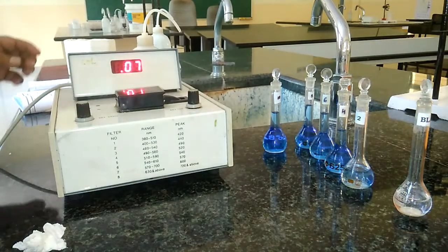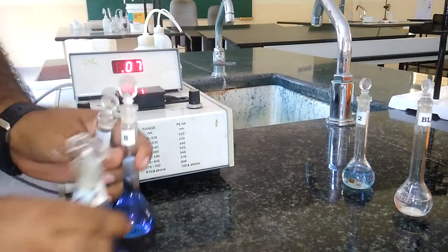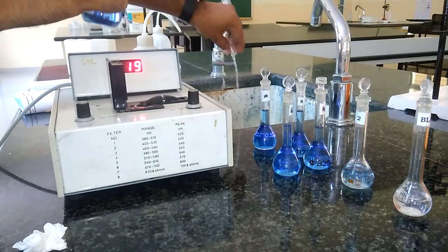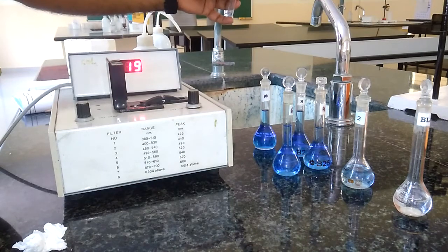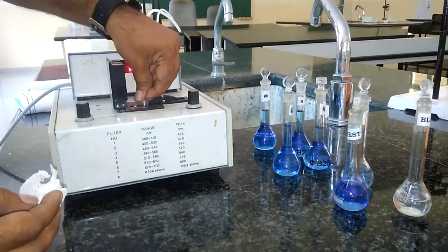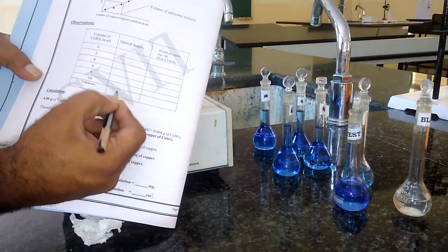Similarly, we record the absorbance of all the standard solutions — 4 ml, 6 ml, 8 ml, and 10 ml. After recording all standard solution absorbances, we also record the absorbance of the test solution. Rinsing the cuvette with the test sample, then filling three-fourths and wiping well before placing it inside the colorimeter. It is giving 0.16 or 0.17 — 0.17 for the unknown solution. So the optical density for the test solution is 0.17.